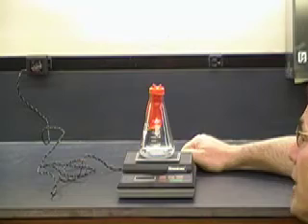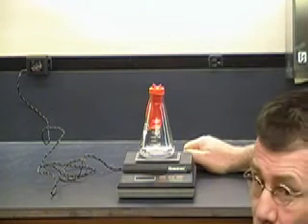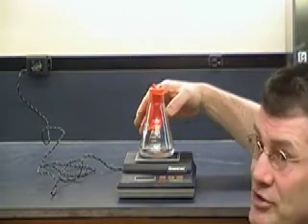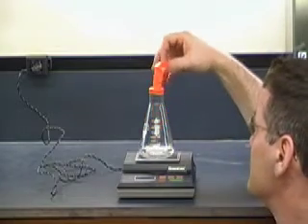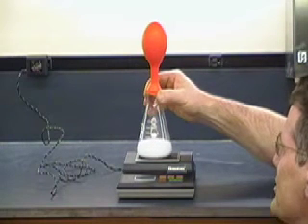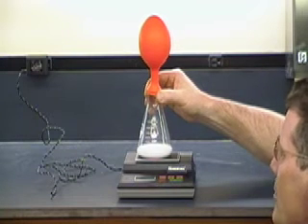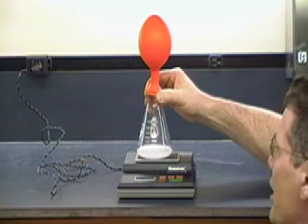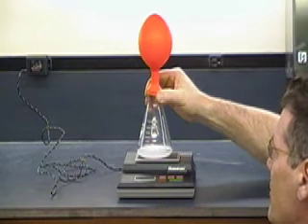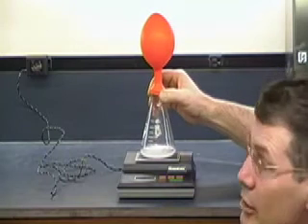So now I've got it set up here on the balance, and it's about 132.1 grams. Now I'm going to let the baking soda and the vinegar mix here, and then we're going to see what happens. What do you think is going to happen? It's probably a good idea to hold on to the rubber here while this thing inflates. Now the chemical reaction is occurring, and what's happening is we are getting a whole bunch of carbon dioxide being produced, CO2, one of the greenhouse gases. All right, and that reaction looks like it's pretty much done. So I'm going to take my fingers off here just a second, and we're going to see what's happened to the mass of the container along with the reactants.